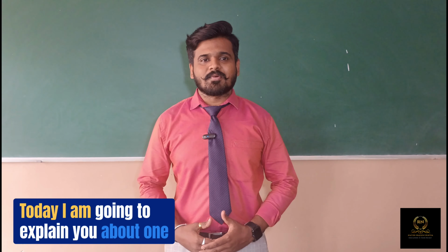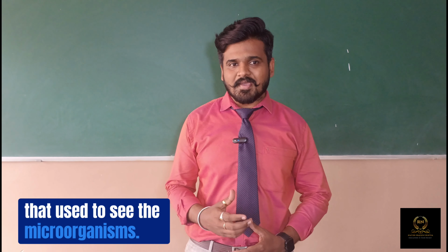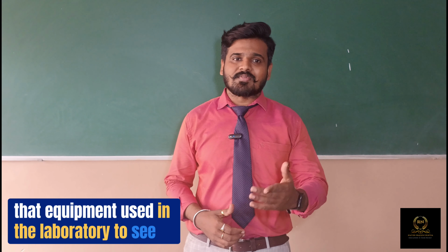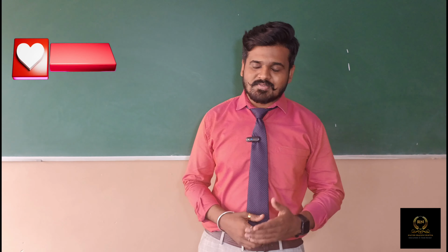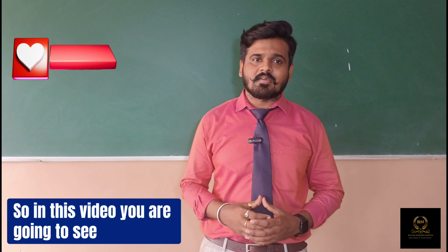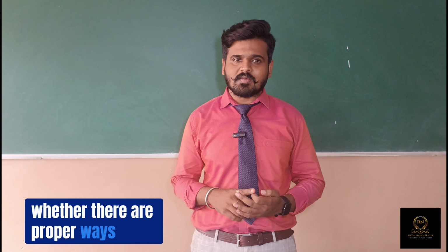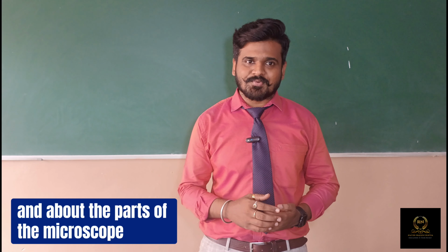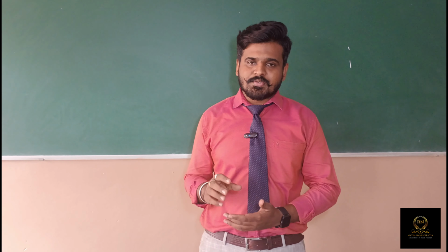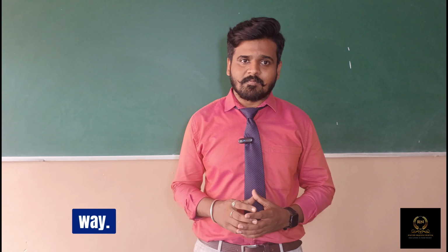Today I am going to explain one of the main laboratory equipment used to see microorganisms. Can you guess what equipment is used in the laboratory to see the microorganisms? That is nothing but the microscope. So in this video you are going to learn about the microscope, how to handle the microscope, there are proper ways, and about the parts of the microscope, and I will explain what each part does, its function. So let me go first with how to handle the microscope in the proper way.